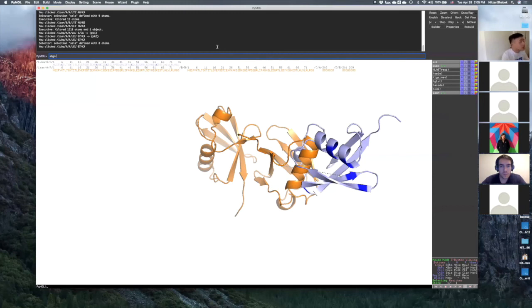And the most important thing is, what is the moving molecule, and what is the molecule that is the reference, okay? I want the diubiquitin to be my reference point, and I'm going to superimpose the one ubiquitin, the first ubiquitin, on the two ubiquitin, okay?